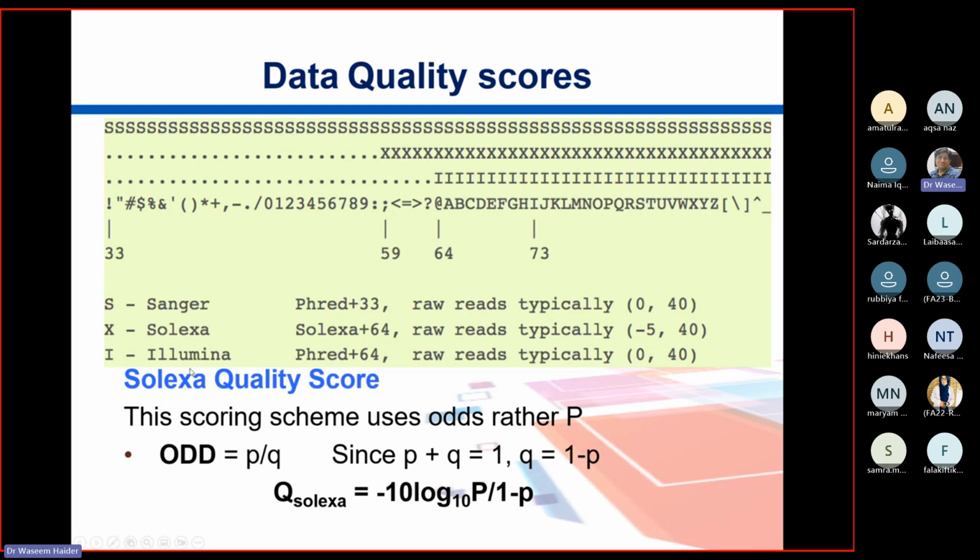What Illumina did was a wonderful thing. So they came up with the Phred formula, this formula from Sanger, and the offset from Solexa, and obviously it's a new thing. So nobody can challenge you. So they start with this 64. So to 0 they added 64 and they started with the at sign. A was 65, B was 66. So if you see a B character, B means bad, or A means also bad, and the at sign means 0, right?